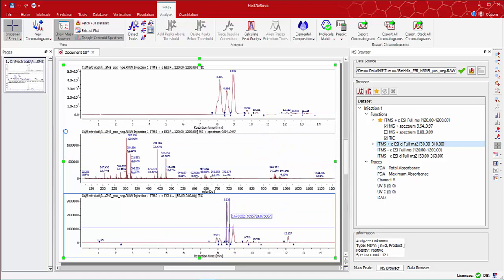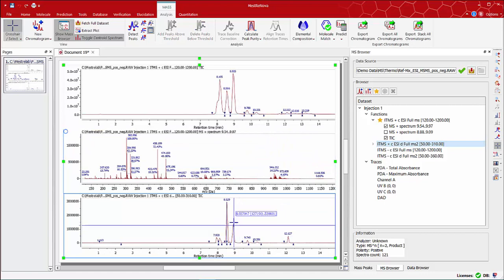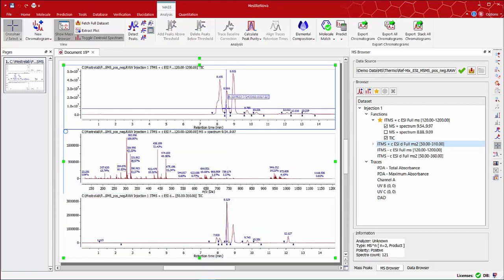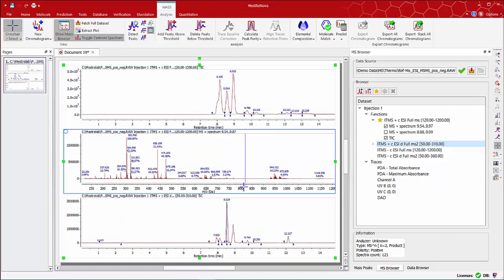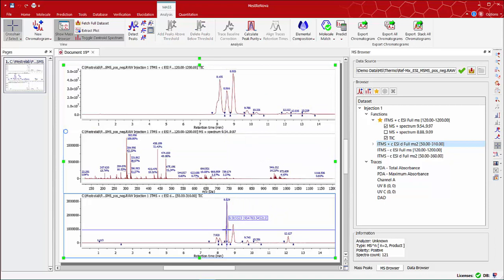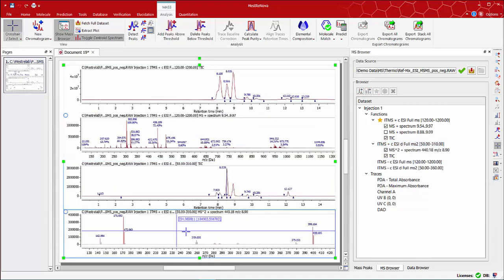You can see the TIC for the MS-MS data and as we did earlier you can click on any points to show the MS fragmentation.